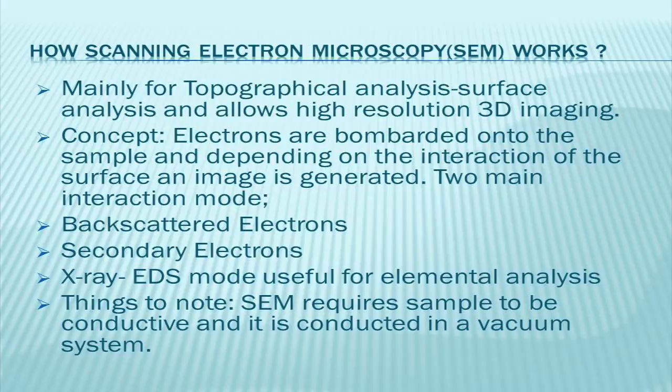A plus point of SEM is that it allows for elemental analysis via the EDS mode, in which electron bombardment brings about characteristic X-rays of the element and thus gives the elemental composition. Things to take note: SEM requires the sample to be conductive, and thus silicon wafers are used and a drop cast method is adopted to attain nickel nanoparticles and gold nanocubes in this experiment. Non-conducting samples need to be sputtered with gold to obtain conductivity. In addition, SEM is conducted in a vacuum chamber, and thus the sample has to be compatible with vacuum. Hence, living biological samples can't be analyzed via SEM.